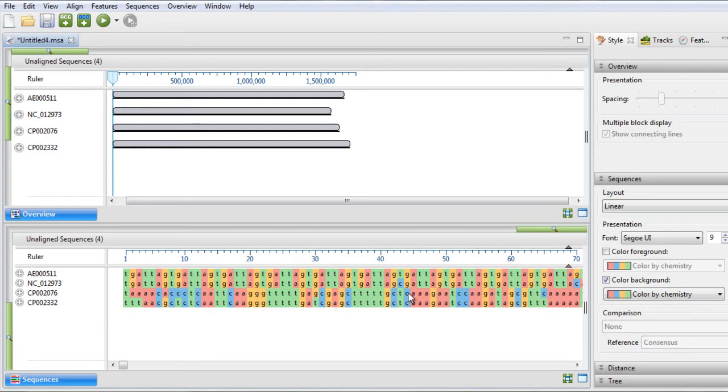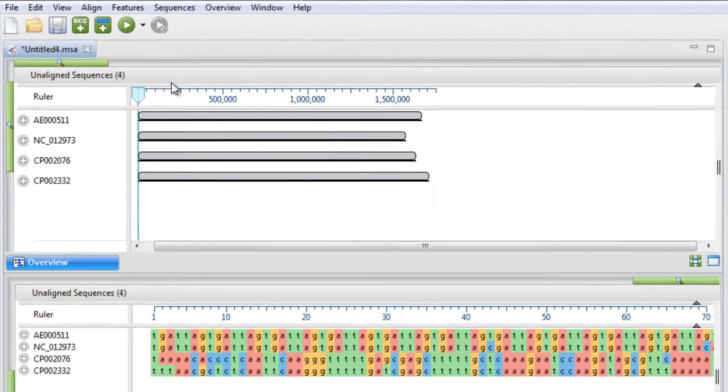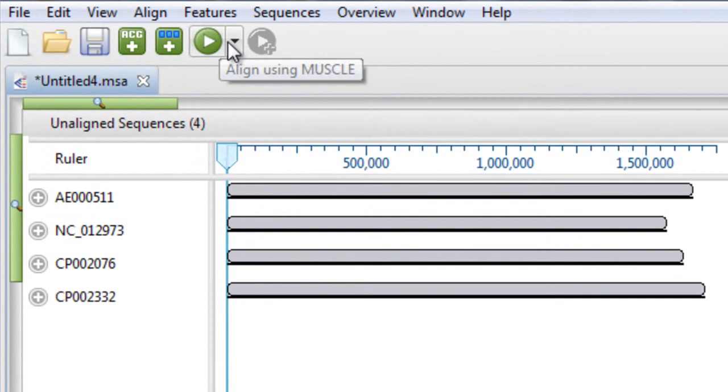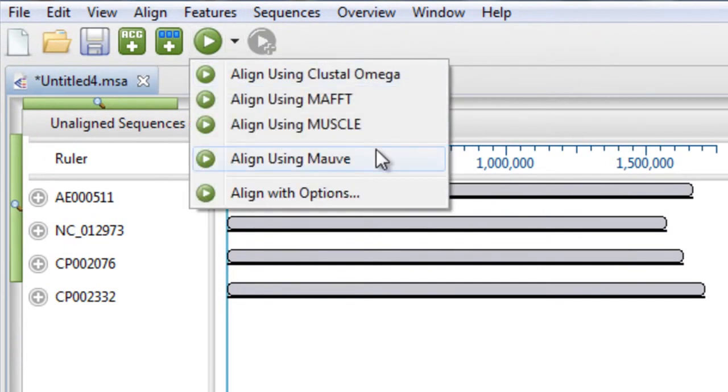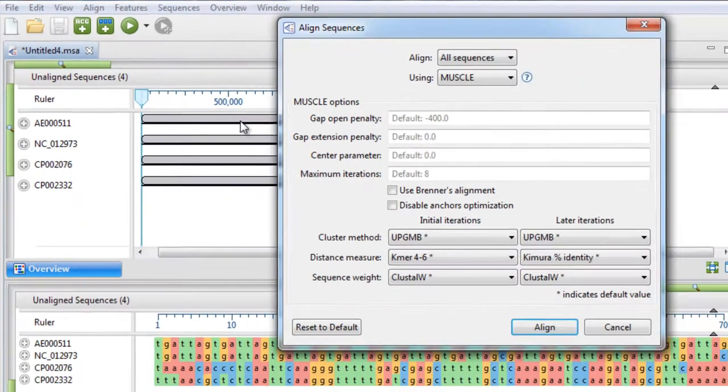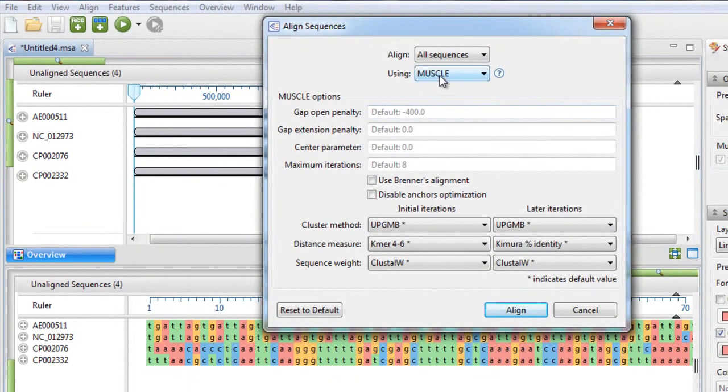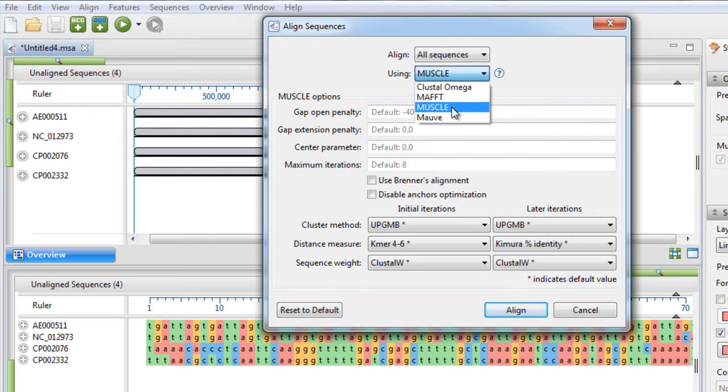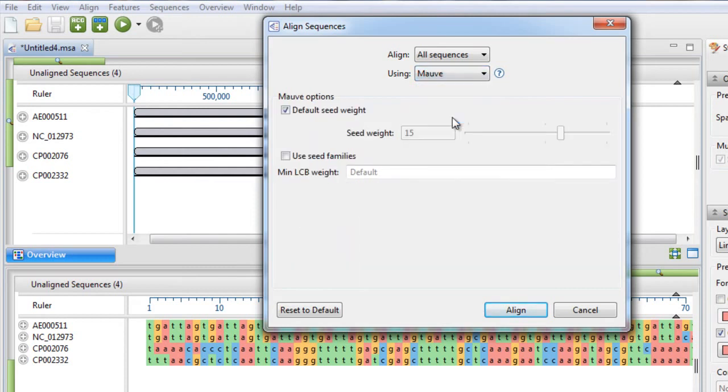Now we want to align these sequences using Mauve. We can align using the default parameters by selecting Align using Mauve, but we can also adjust the parameters on our alignments by selecting Align with Options, choosing Mauve, and making any desired changes before selecting Align.